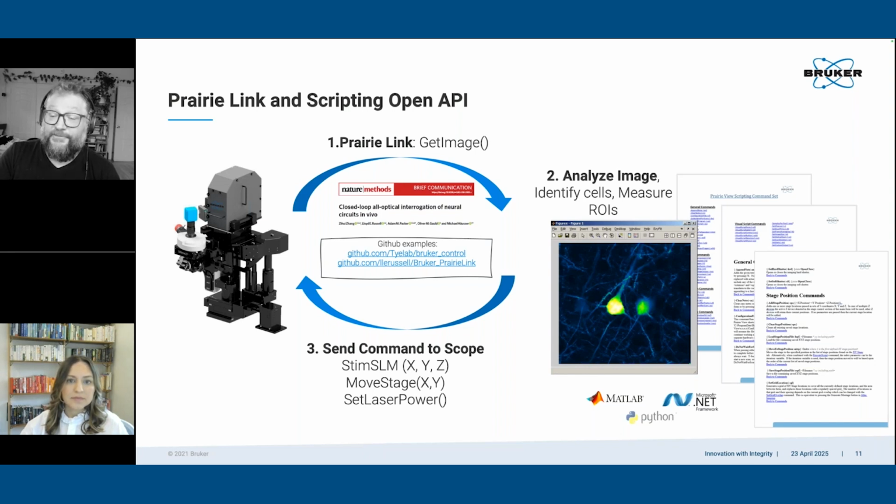Personally, I like to use 3dvolreg if it's a volume. This is part of AFNI. I guess Suite2P is really commonly used because it's fairly fast, but I also think there's a great tool called Advanced Normalization Tools, or ANTs.